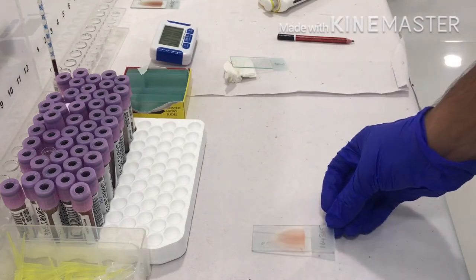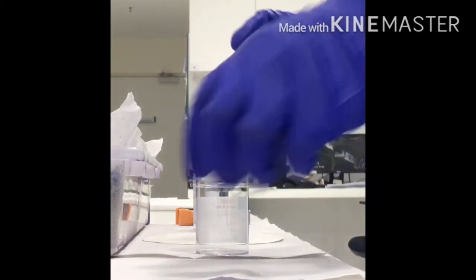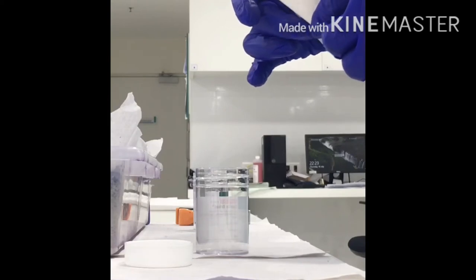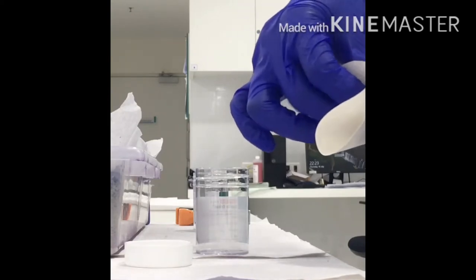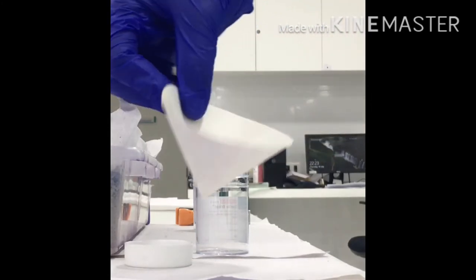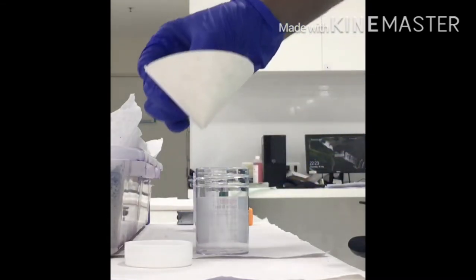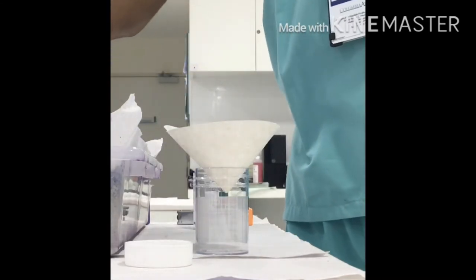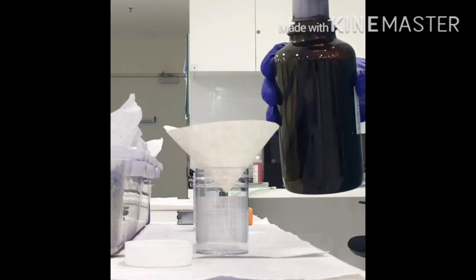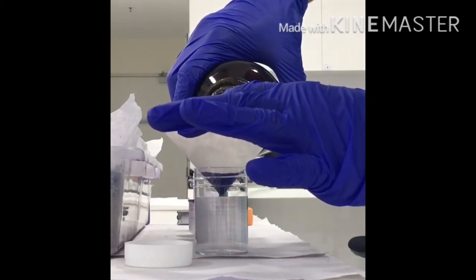And this slide I have taken from downstairs. We should never do that. Whenever we do staining, we have to make sure that the stain is free of sediment, so we have to filter it. Here I have used Whatman number 1 filter paper. We have to make it a funnel-like structure just to filter it. Whenever we do a smear, we have to make sure that we are filtering the stain.